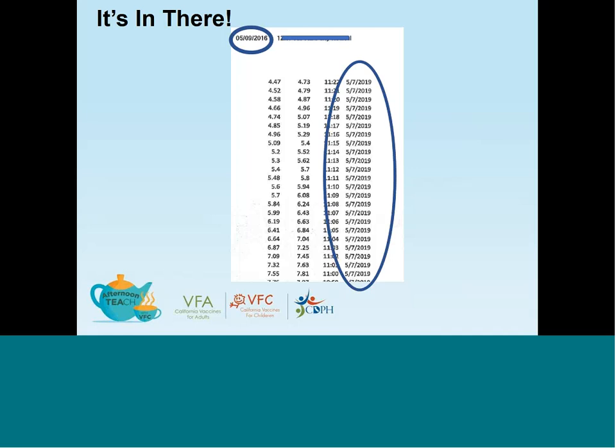And of course, we know 2019 has not occurred yet. So in this situation, this is, again, an opportunity for training. I would go back to this particular device and make sure it's configured properly according to date and time. And as an added measure, I would double-check the alarm limits that have been set for this device as well.